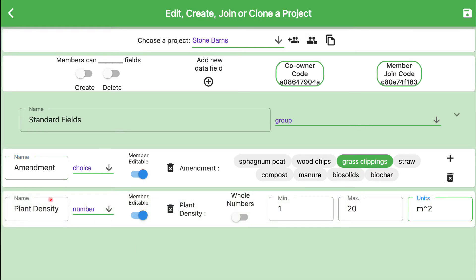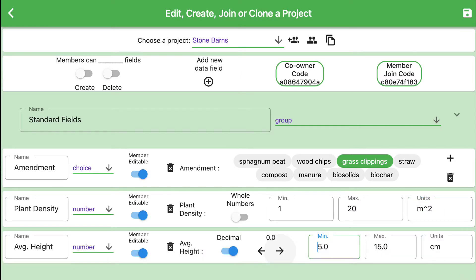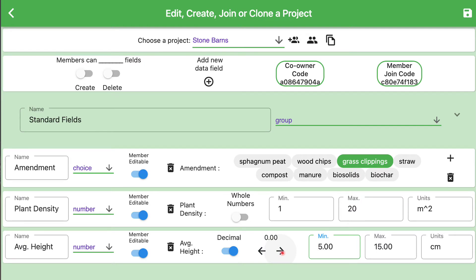Here we've created a new field called plant density, and it is an integer number type. Since you can't have half a plant, we'll use whole numbers, and let's say it ranges from 1 to 20 plants per meter squared. What if we want a number that needs to be represented by a fraction or a decimal? Here we've added a new field called average height, and our units are in centimeters. Since we can have partial centimeters, we make this a decimal. We can choose how many decimal places or how much precision to give this field with the two arrows shown here. I clicked on the right one, and now I've given it two decimal places of precision.